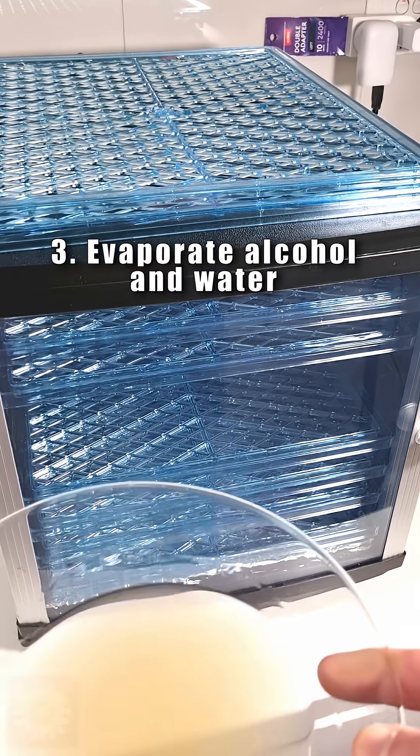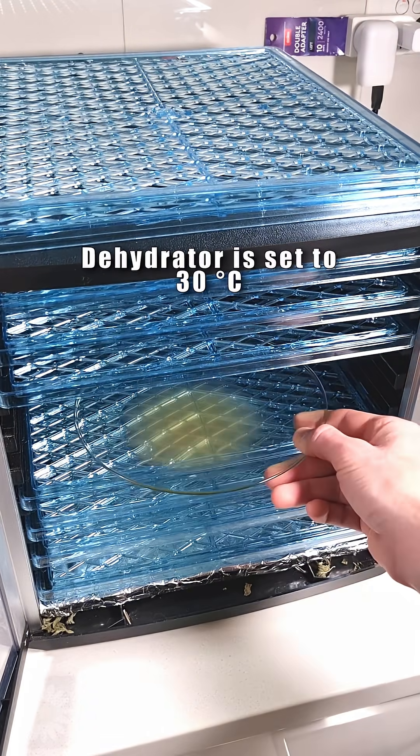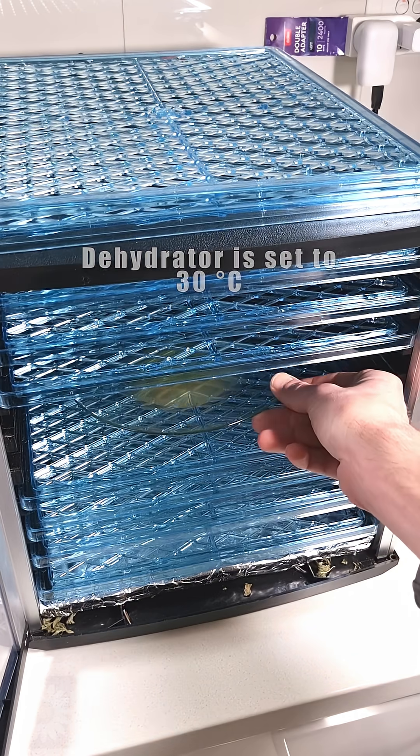Then, gently evaporate the tincture to remove alcohol and water. In our example, we used a dehydrator set to 30 degrees Celsius, which took 5 hours.